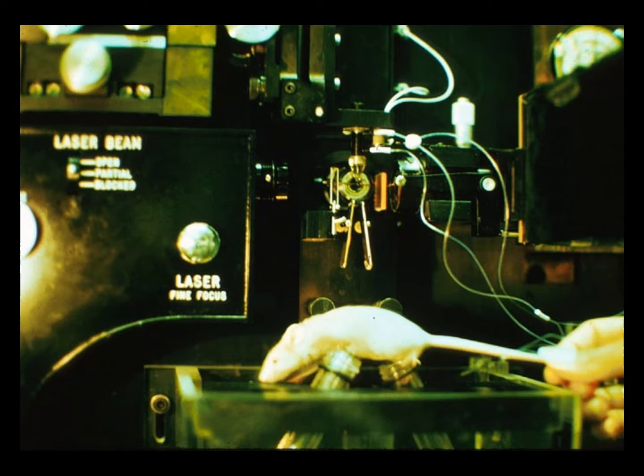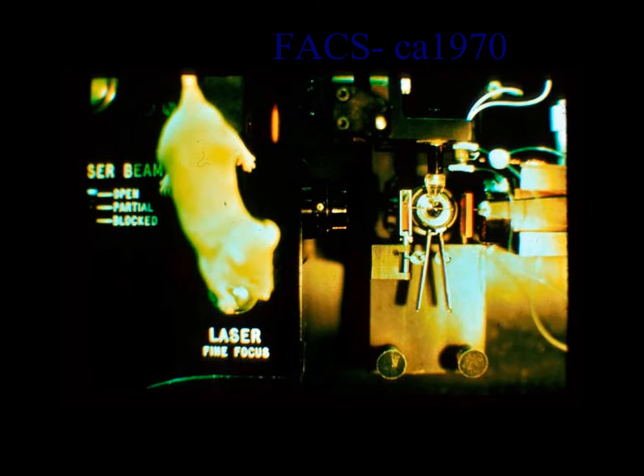We're going to have another picture of the mouse, and there he is. And he's adjusting the fine focus, be sure that the operator doesn't have to do it, right? So he's going to donate a spleen, probably, maybe lymph nodes, maybe thymus, who knows? But I don't recall. Maybe somebody does. They can tell me about it.